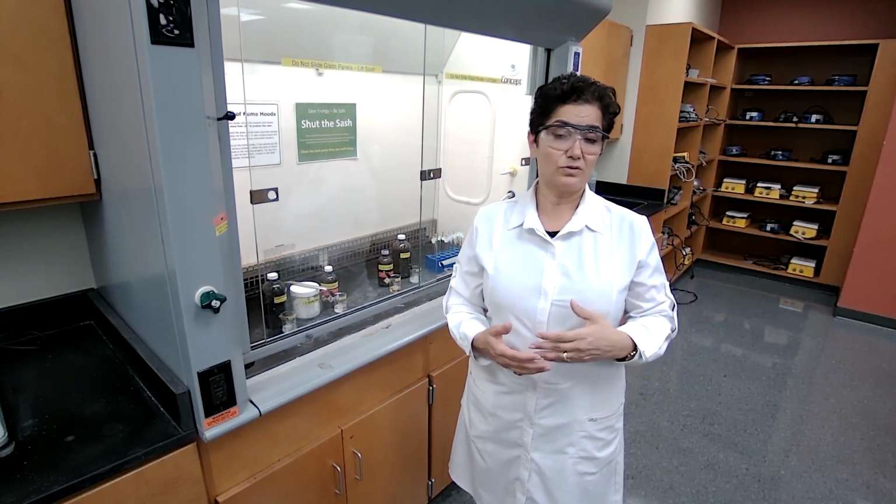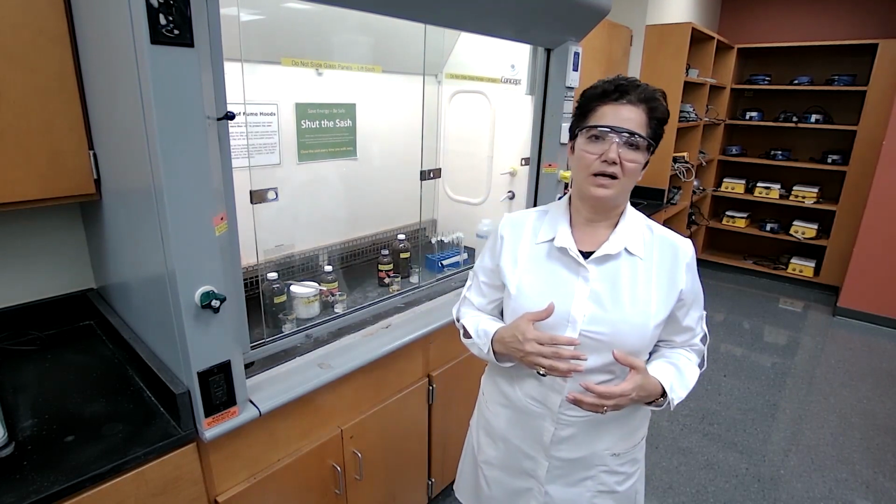When you read the experiment from the lab manual, and I also want you to please watch the video for the pre-lab discussion for this experiment, you would see the tables that tell you which functional group would be soluble in which solvent. So in general, we are going to start with the solubility test first.